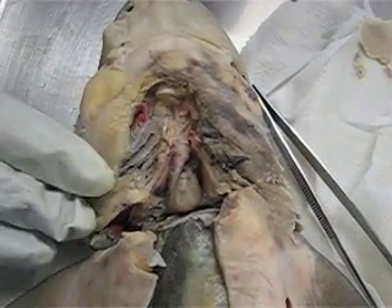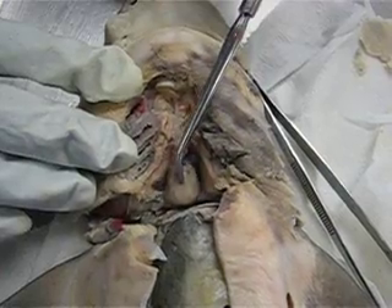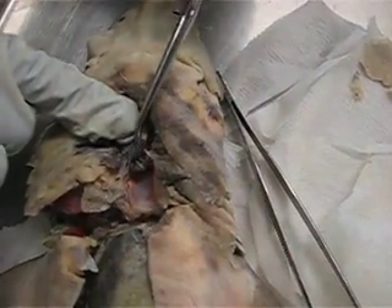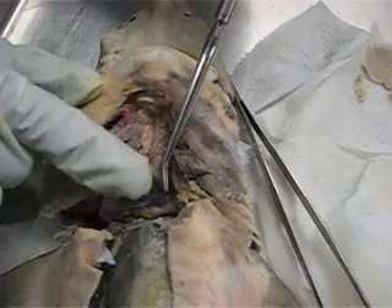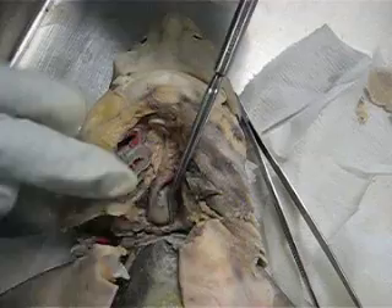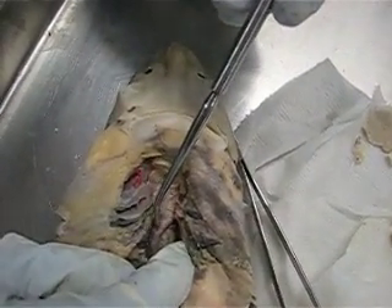This is the shark circulatory system. Right here is the heart. Here is the ventricle. More dorsally and darker is the atrium right here. We are going to have our sinus venosus, which is just a cavity, more posterior. And here, these pink structures on the heart are the coronary arteries.